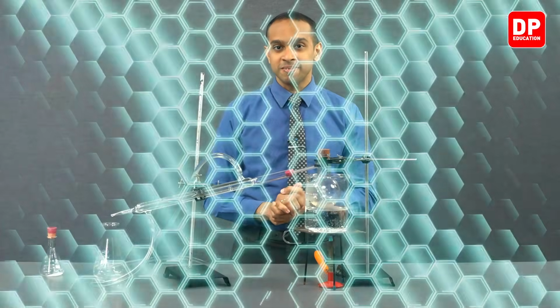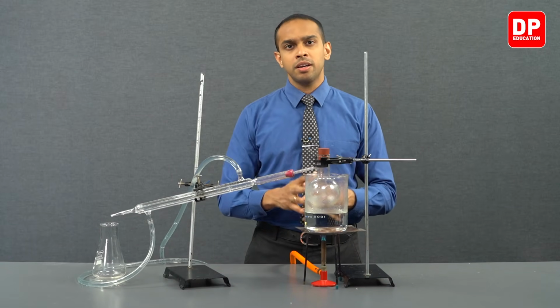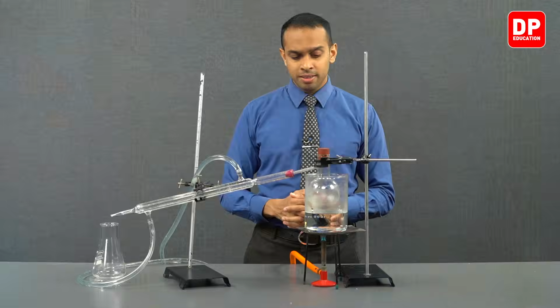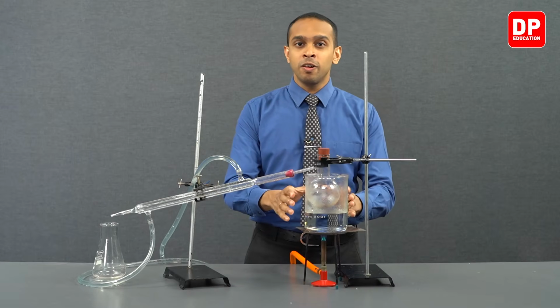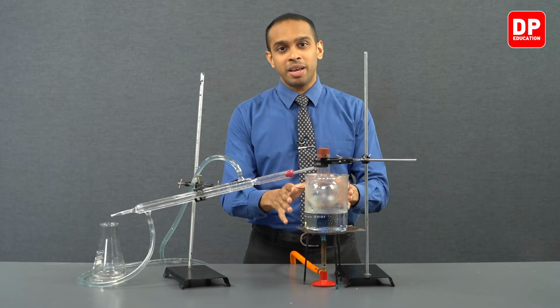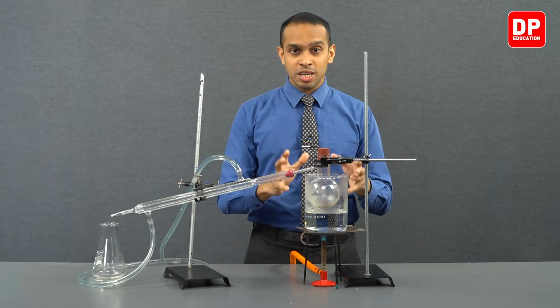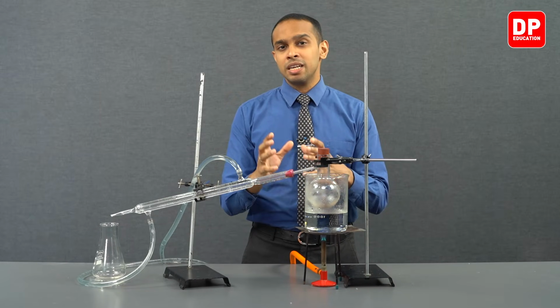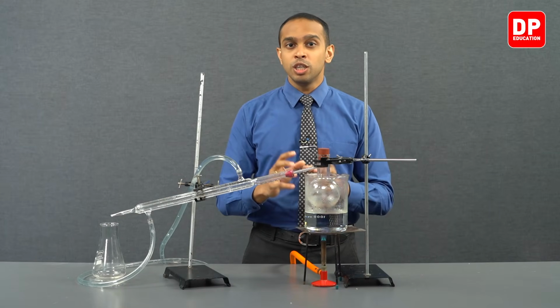Now students, we have allowed this system to run for a few minutes. Now we have evaporated our diethyl ether layer, and we only have the essential oil remaining over here. So as we use cinnamon leaves, the main component found in the essential oil of cinnamon leaves is going to be eugenol.